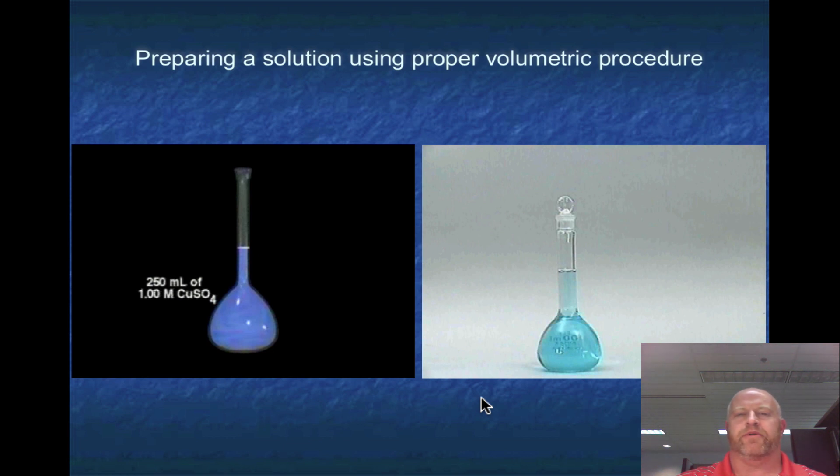The last part there about inverting the stopper—if you don't mix after you add that last bit of water, what will happen is in the top side of your solution you'll actually have a less concentrated form of your solution. It'll be more concentrated towards the bottom. So once you get to the volumetric flask you want to make sure you do a last set of mixing to get all that solution completely mixed evenly so the concentration is even throughout.